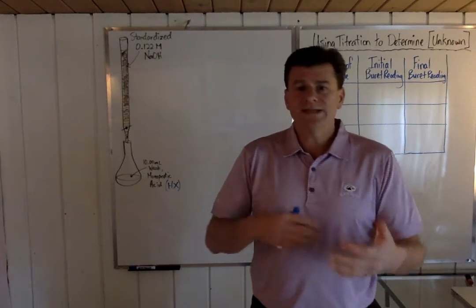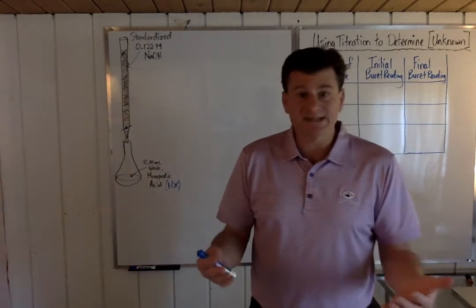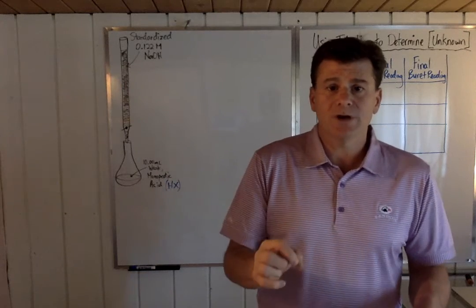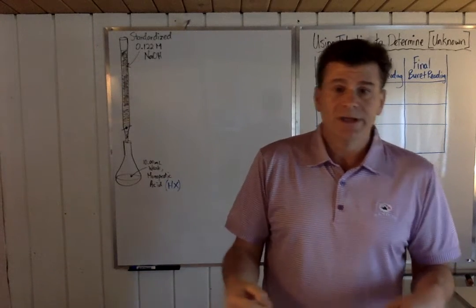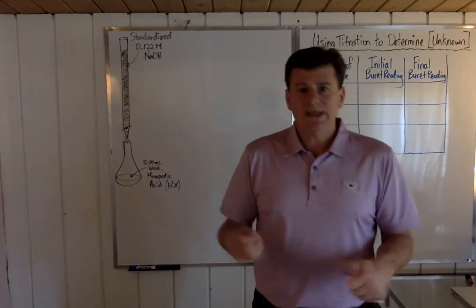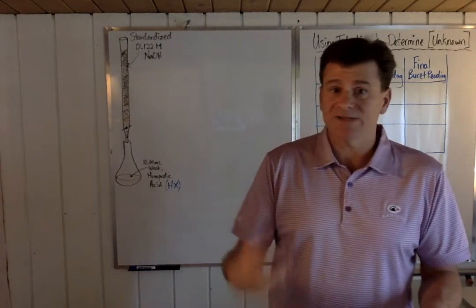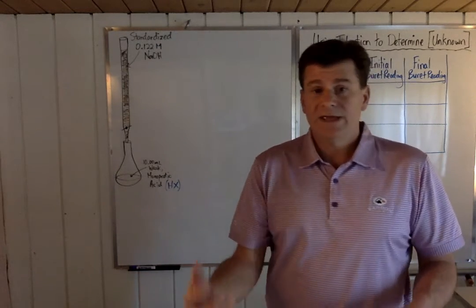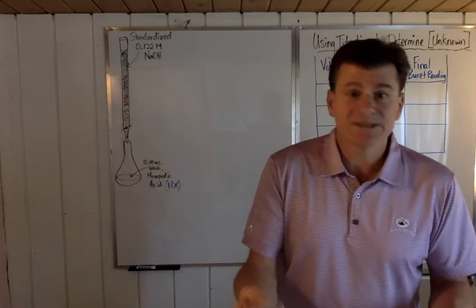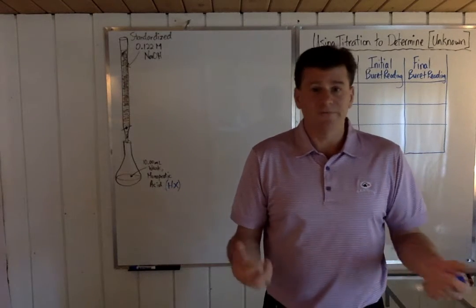So I use a standardized solution of sodium hydroxide. Now, what is a standardized solution? A standardized solution is one where you know the concentration. It's of known concentration. The purest way of knowing something's concentration is to make the solution yourself from scratch. You add a certain mass of pure compound into distilled water to make up a very specific volume of solution, and you do that using a volumetric flask.